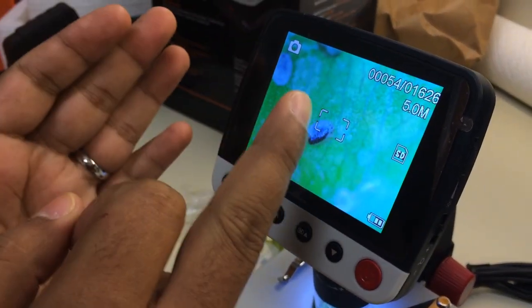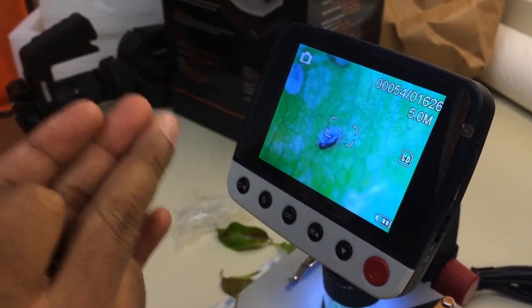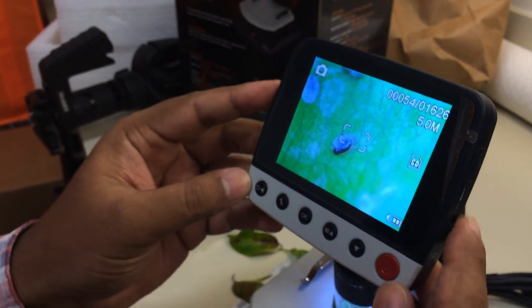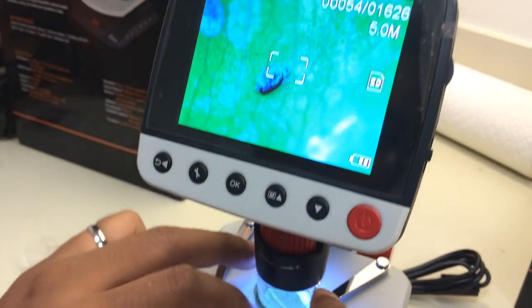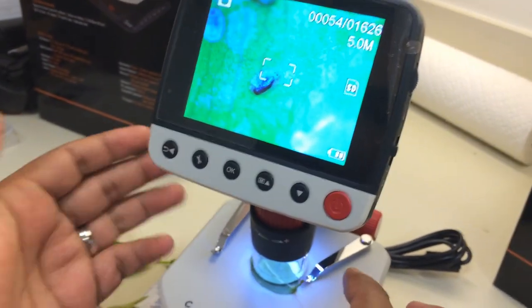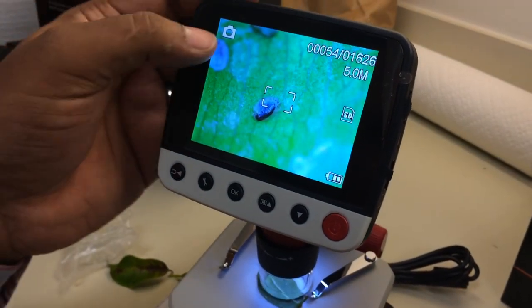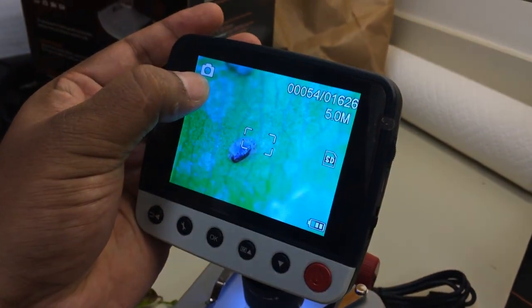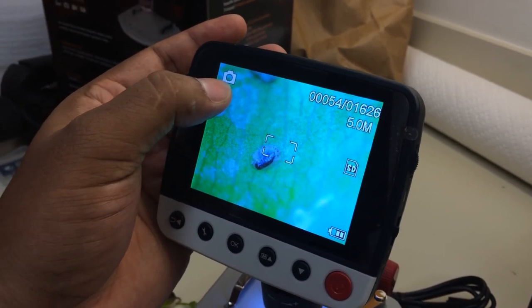How to switch from camera to video camera in this microscope. We have already adjusted a leaf under this microscope. You can see that this icon is showing the microscope is on.